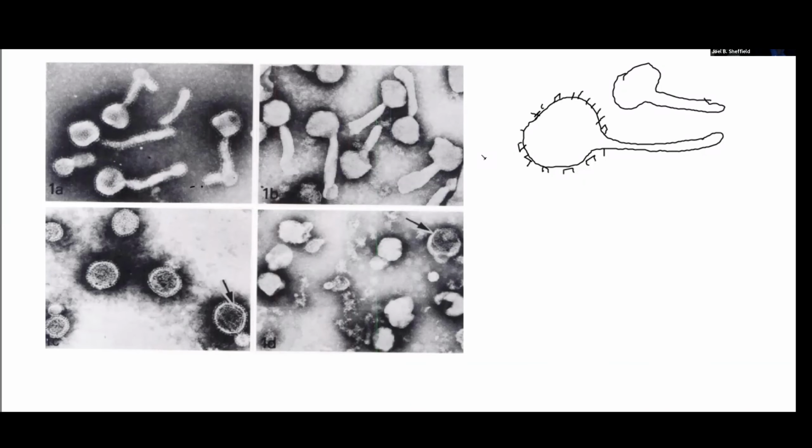Well, at one point I started wondering about the origin of this shape. What gives you the shape? And I realized that, in fact, what was happening was the stain, as it dried down, was creating a hypertonic environment and shriveling up these virus particles. And so there's a separate question. If they shrivel up, why don't they shrivel up into a prune? Why do they shrivel up into this kind of structure? But that seems to be what you got.